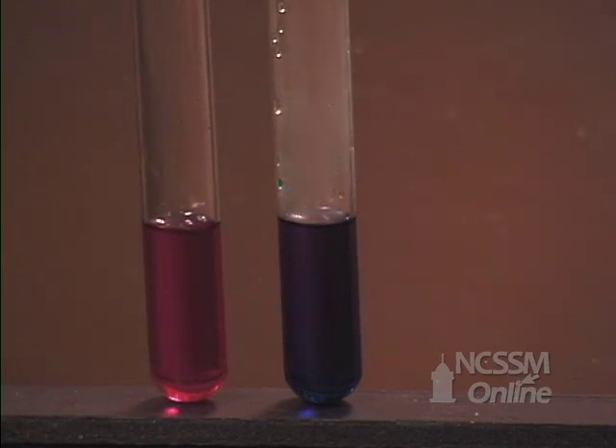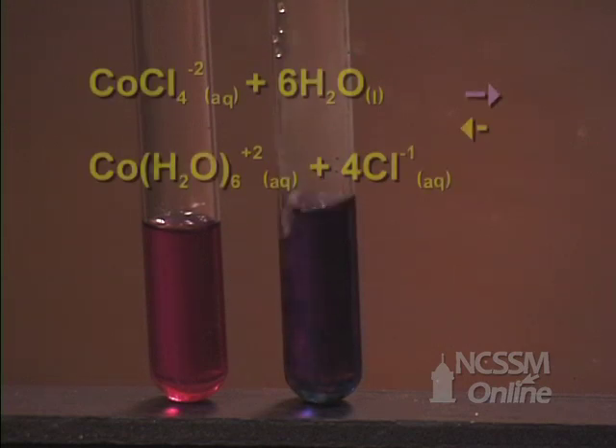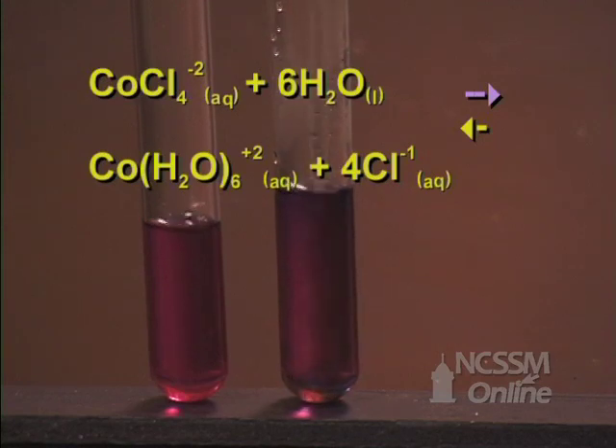We will now add water to the test tube. We notice that the solution has turned back to pink. By adding water to the solution, we've shifted the equilibrium back in the forward direction.